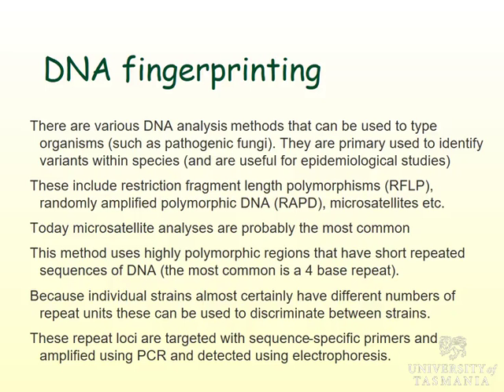So if you isolate some DNA, every time that sequence appears, it'll chop it at that point, and then you'll get a cut. And then you can actually look for the size of the fragments. So if you've got one big molecule and it cuts here, you end up with a short one and a big one. If you've got one that cuts there and cuts there as well, you might end up with a short one, a slightly bigger one, and then a bigger one still.